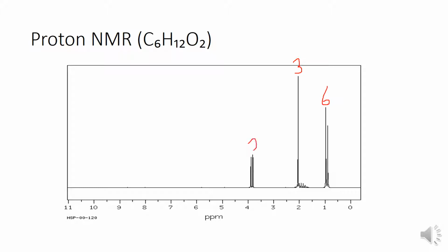So now we can start to attempt to draw our structure. We do know we have a carbon to oxygen double bond, and we know that we do not have any alcohols, so there cannot be any carboxylic acids or anything of that nature. So we are looking at, more than likely, having an ester. So we'll start by drawing our ester. Here's our double bond, oxygen, 1 carbon, 2 carbon, there's that, and there's our full ester.